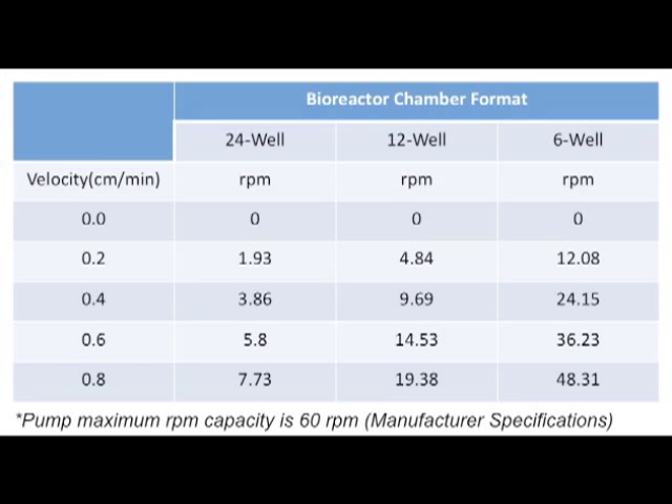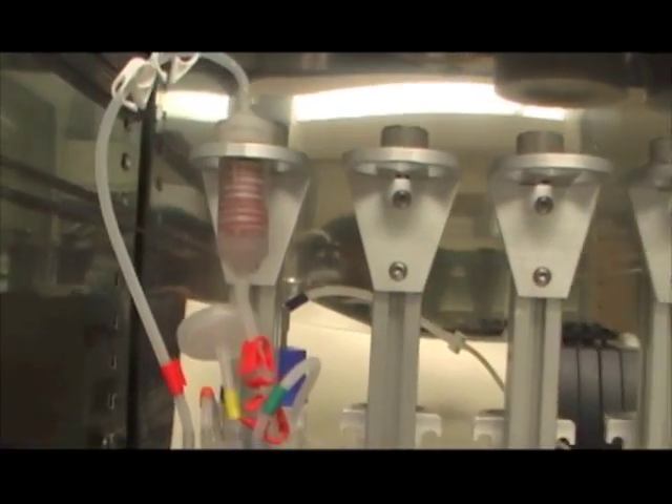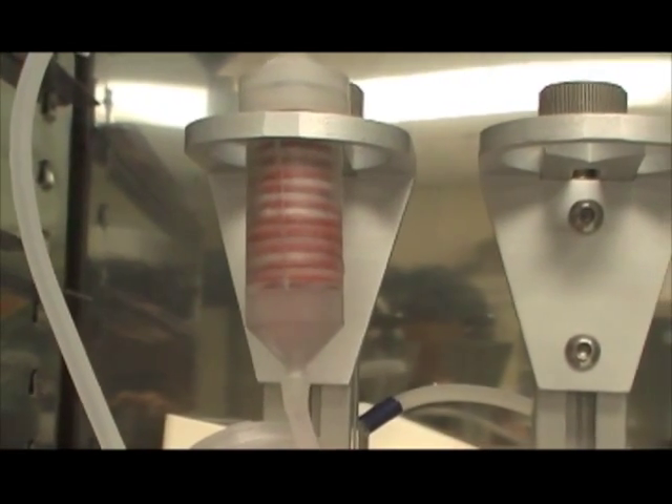Once placing the bioreactor chamber back into the water-pan-free cell culture incubator, set the peristaltic pump RPM to produce a mean flow velocity of 0.2 centimeters per minute, as seen in the following velocity and RPM table. This value has been optimized to increase initial seeding efficiency under flow conditions for 24 hours. Refer to this table for other RPM and flow velocities of interest.